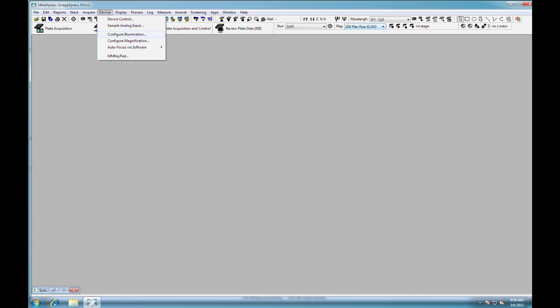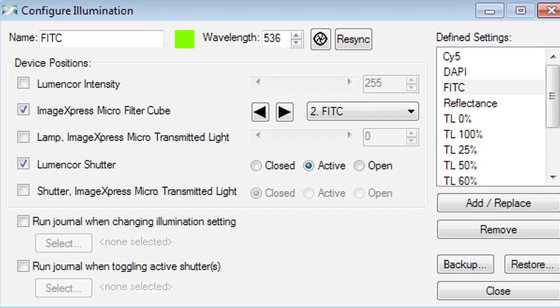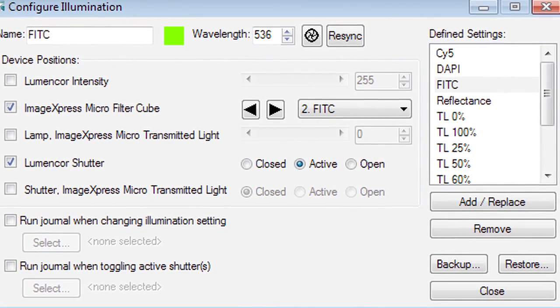In the software, go to the menu Devices and choose Configure Illumination. Verify the filter cube settings. Now you are ready to run your experiment.